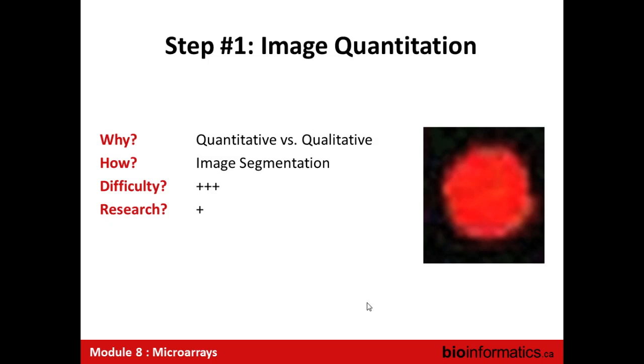Microarrays didn't originally work this way. The first microarrays were images, and grad students looked at 6,000 gene yeast arrays and said, ooh, that spot is darker than that spot. That spot is lighter than that spot. And they did this repeatedly over and over until they went insane. And so one of them goes, you know, I'm going to write a computer program to do this so that I don't have to do this much work. I wish I was joking. So that's actually the way it started, and ultimately we have to do this.